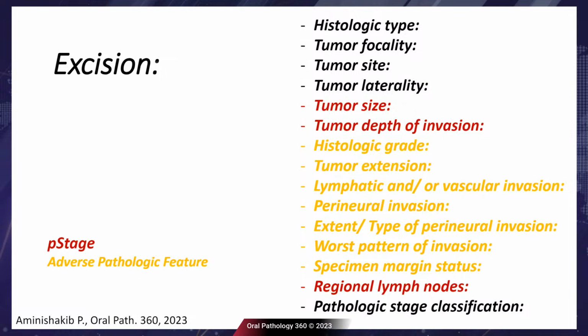Also, some adverse pathologic features must be mentioned in the report, including histologic grade, tumor extension, lymphatic or vascular invasion, perineural invasion, and the extension of the perineural invasion. Also, the worst pattern of invasion and the specimen margin status.